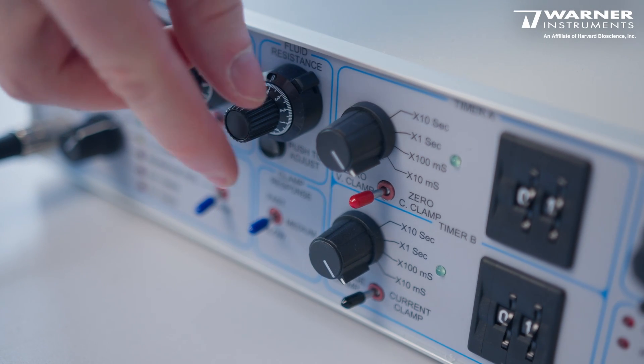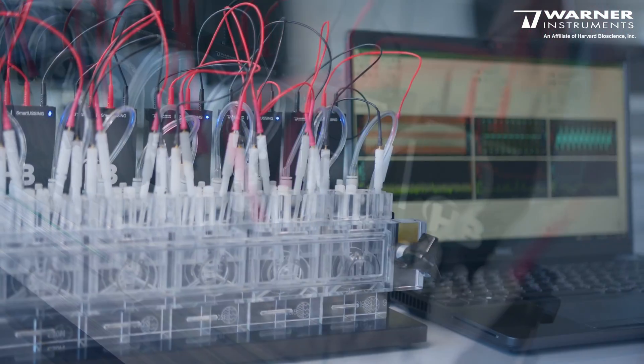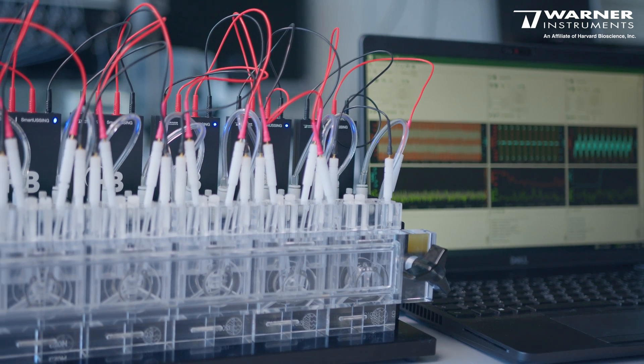Most importantly, the Smart Ussing amplifiers are fully computer controlled and don't need any manual adjustment on the amplifier at all. In most other Ussing systems you have to perform a series of manual adjustments on the amplifiers before you can even start your experiment. In Smart Ussing, the amplifiers are controlled directly by the software and all calibrations are done within a few clicks — a process that could take around 30 minutes in a traditional setup will take only a few seconds.